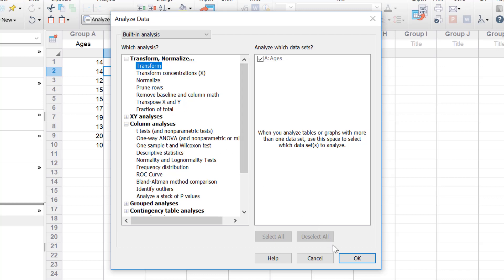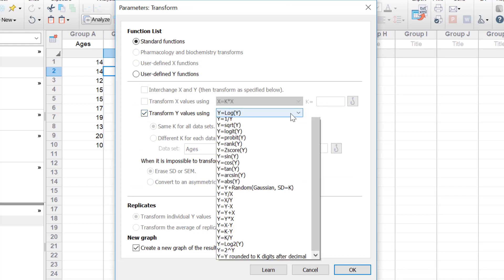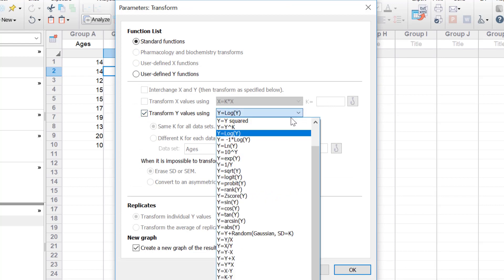Click ok and then under the transform y values using change this value to y equals log y. This will do a log transformation with the base of 10.